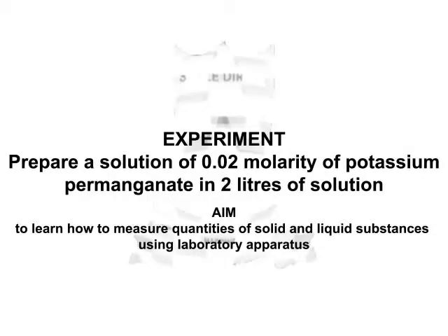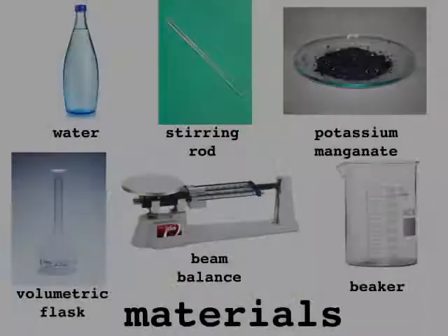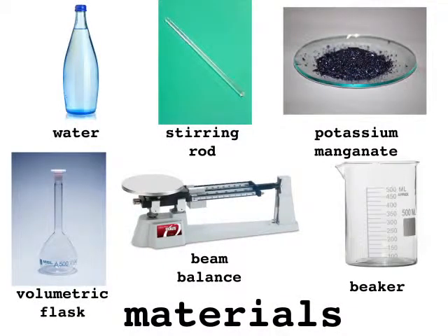Hello students. Today's lesson aims to show how to measure quantities of solid and liquid substances using laboratory apparatus. We will prepare a potassium permanganate solution to show how to measure the substances and how to use the apparatus. It is very important to take accurate measurements of various quantities for better experimental results of scientific processes.